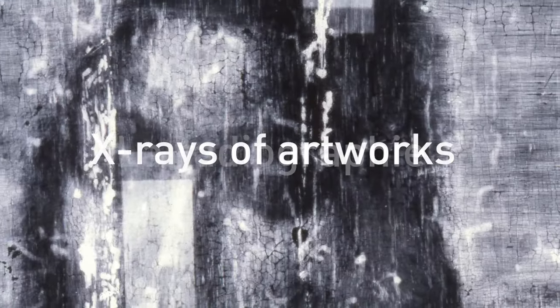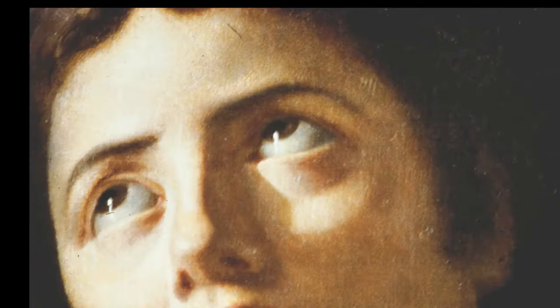X-ray of artworks. Radiography. If we want to see beyond the preparatory layer of the painting, we can get more information from an X-ray picture. Radiography shows the exact condition of a painting without the need for any sort of intervention on the pictorial layer. In addition, the technique provides information about the wood or canvas support, stamps on the back, fastening nails, and filling materials.